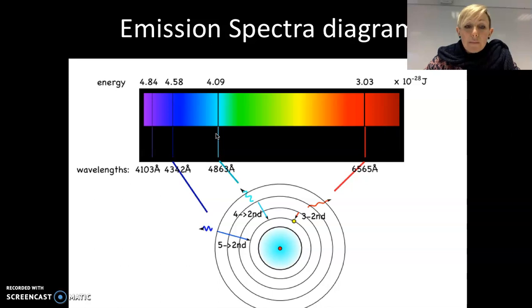So you can make a judgment about the distance that the electrons have fallen based on the colour of light that's being emitted. Okay. So that's just a little bit of theory about why different compounds emit different colours of light. As they fall back to their ground state and release that energy that you've given to them in the Bunsen flame, they'll emit some light, and you'll be able to describe that light in your books.